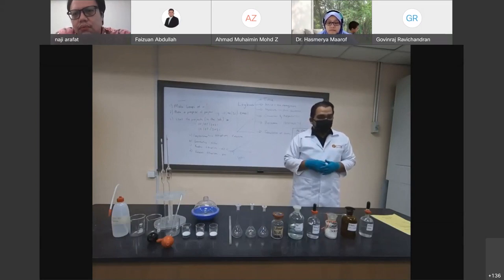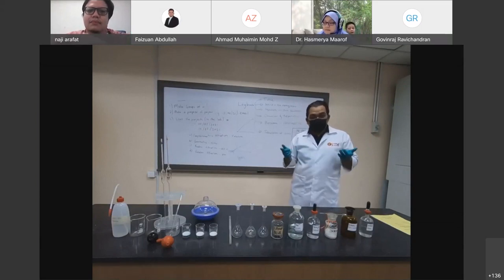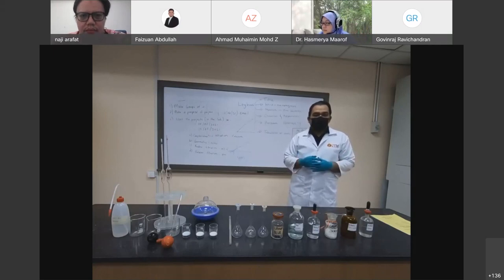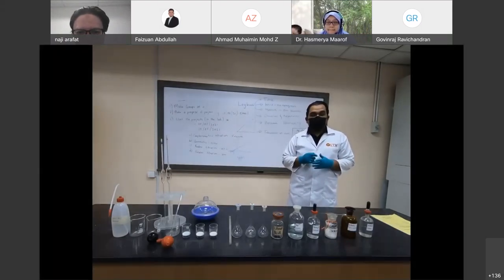I would like to explain the basic principle first. Dimethylglyoxime, or DMGH, is an organic precipitant principally used to determine nickel. DMGH selectively reacts with nickel at a controlled pH of between 5 and 11. The formation of chelates between the nickel 2 ion and DMGH can be written as follows.